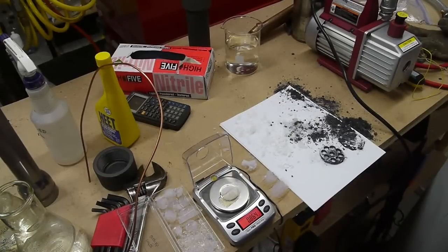The problem is that it's a little more dangerous because the methanol has to be brought up to over 460 degrees F, over 1200 PSI. So having a container full of methanol at those temperatures and pressures is a little worrying.